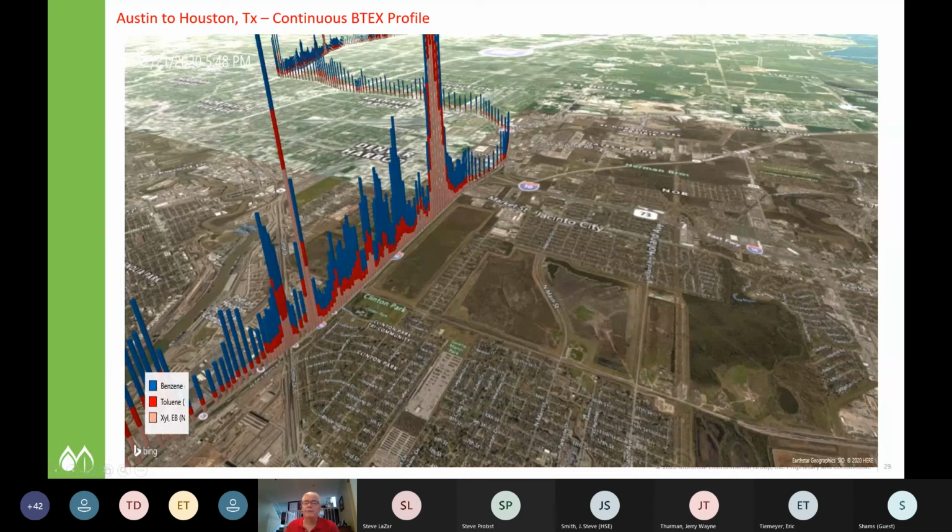So now, if we really wanted to pinpoint exactly where this was coming from, we wouldn't be doing it at 65 miles an hour down the highway. We'd stop and we'd set up a grid pattern, and we would chase a plume basically until we found it. We'd sit there and monitor and accumulate data, just like we did with the stationary sensors, to build into the model for the triangulation.